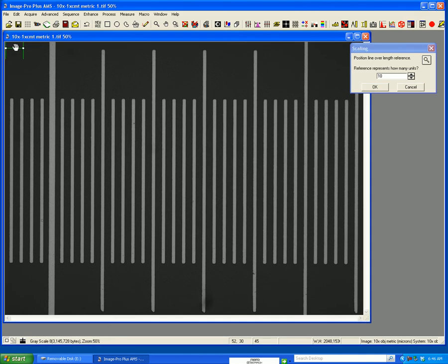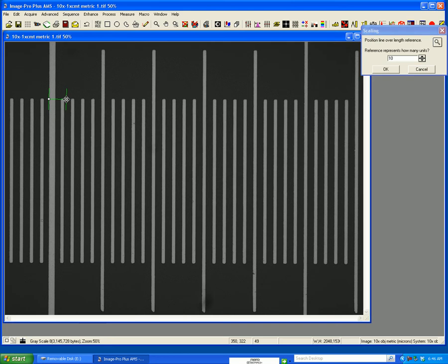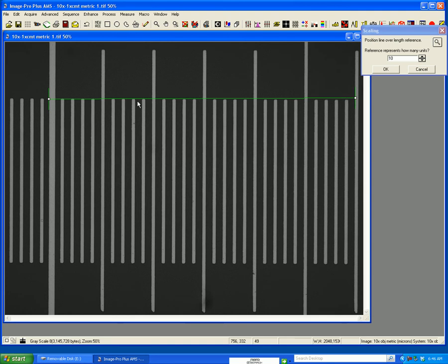If I left-click my mouse button, I can pull this down and I can put the first little box towards the first edge. Then I'm going to hold my mouse over the second box and drag it to the second edge. Like edge to like edge is what you always want to do.